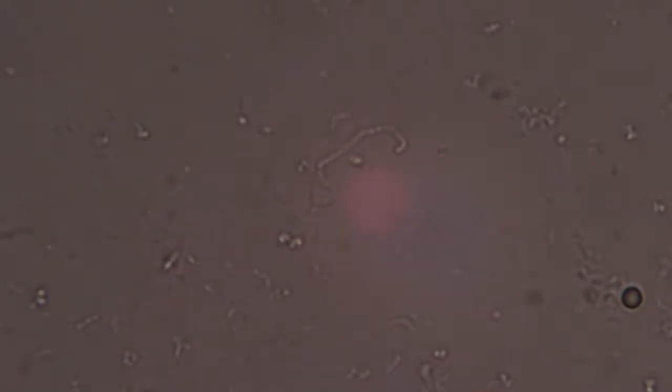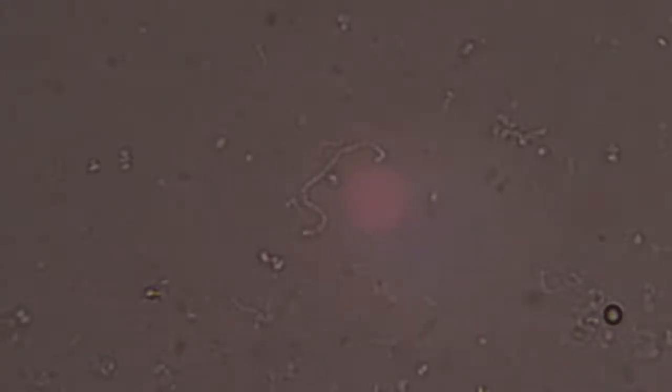Lots of stuff broken apart there, kind of like that cell that broke apart the other night on camera. These are funny little structures, though. That is bacteria. Those little chains of cocci. Bacteria, good stuff.